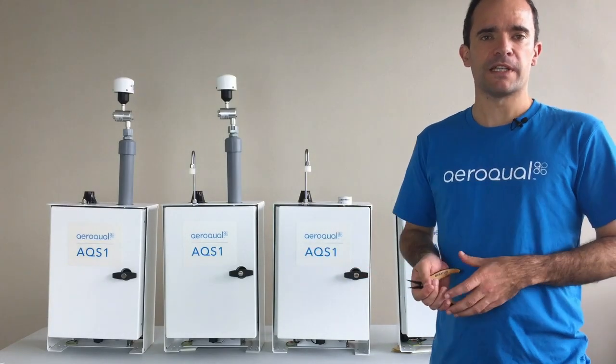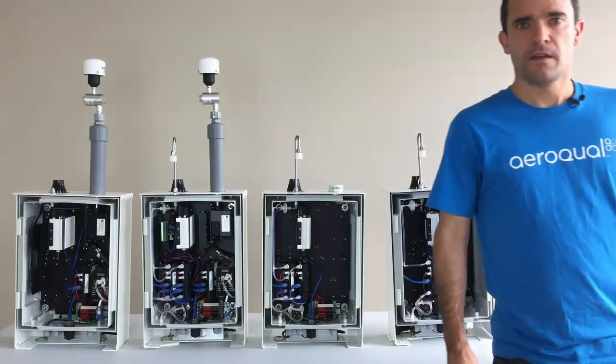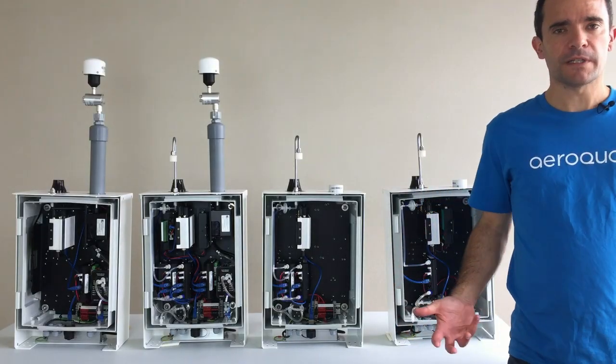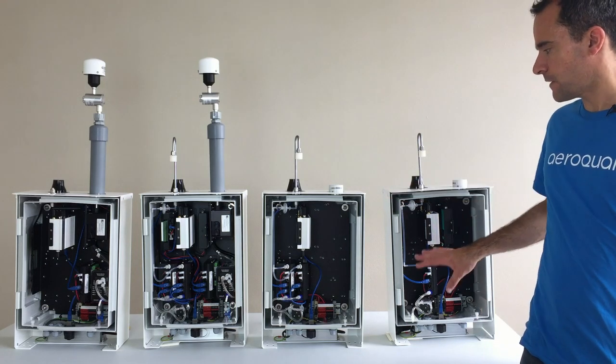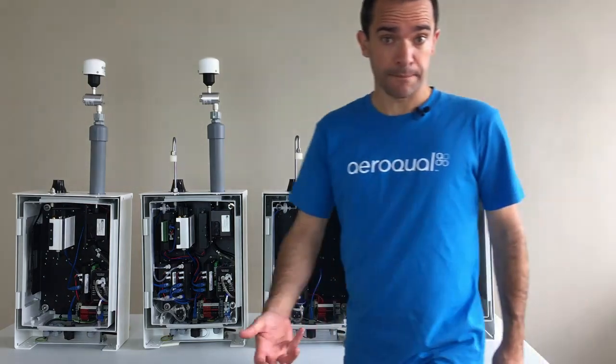Just to make the comparison a little bit easier, what we're going to do is remove the doors. So now we have the doors off, it's a little bit easier to have a look at the inside. Let's take a quick look first of all at the two AQS1s which are configured with gas only.